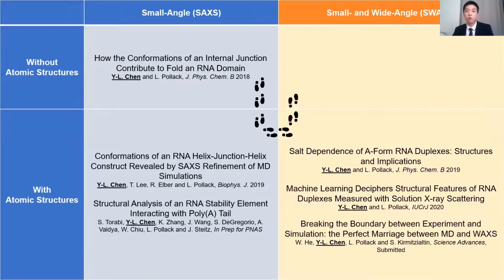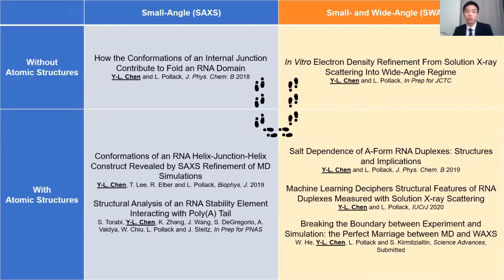And finally, we march even deeper in the frequency space and utilize only the experimental WAXS profile, without any background knowledge of the RNA system being measured, using the frequency marching algorithm.